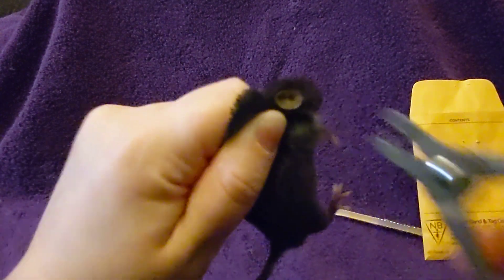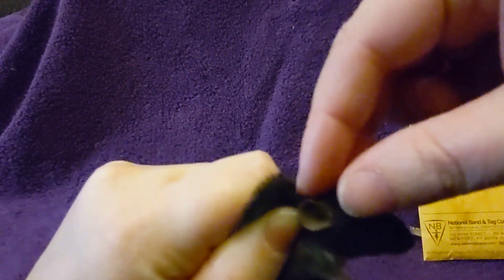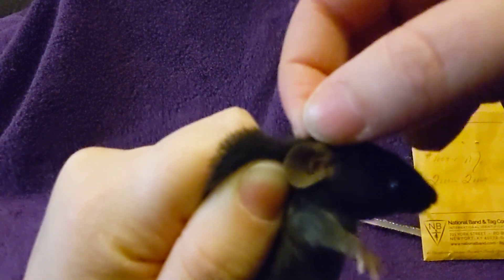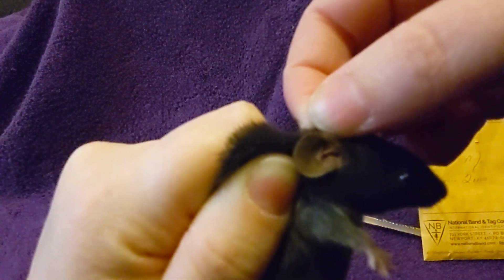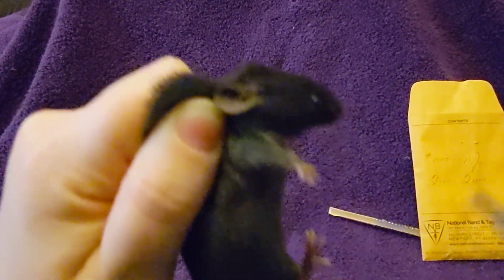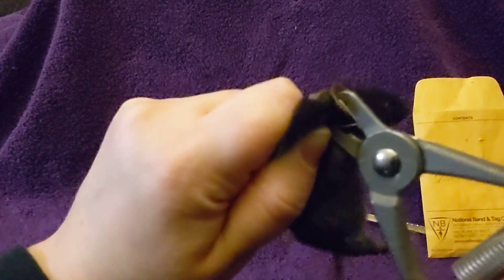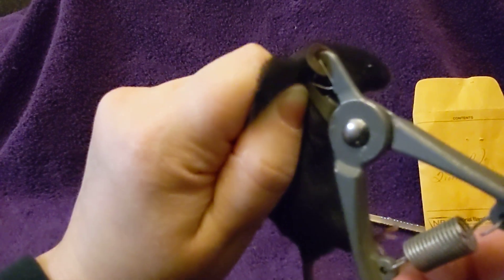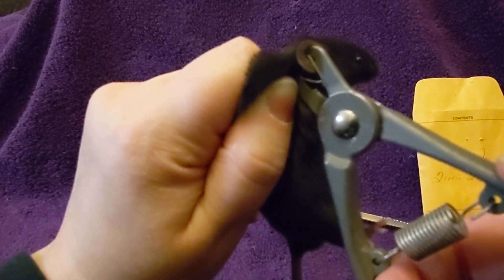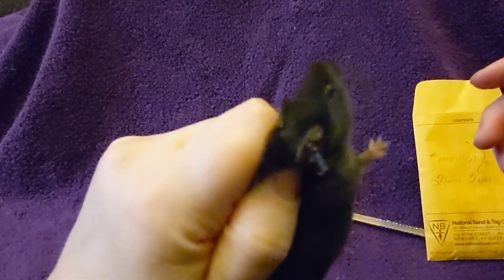It would be really hard to see on a black mouse, but you can sort of see the ridges — the far one in there. Okay, so you stick it in, and then you just press down very decisively like that, and the mouse is tagged.